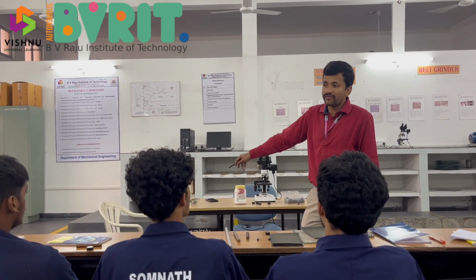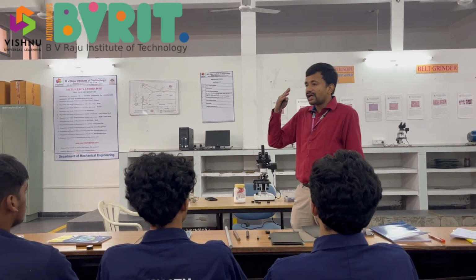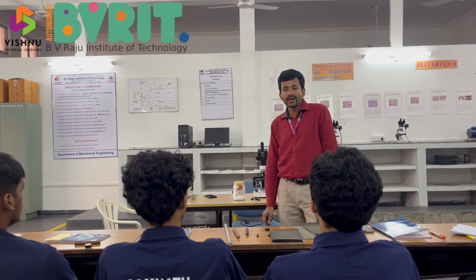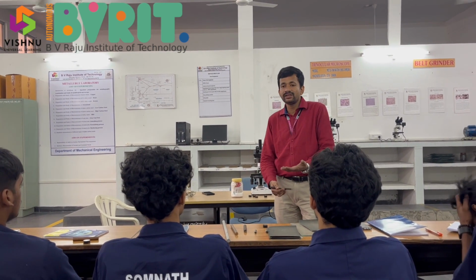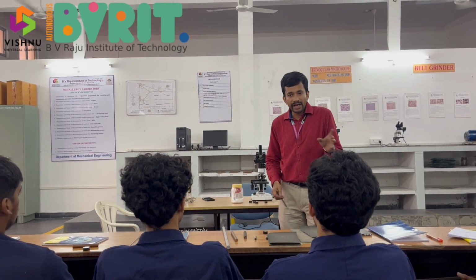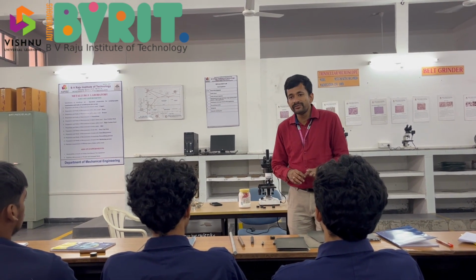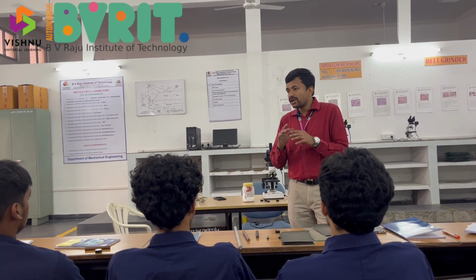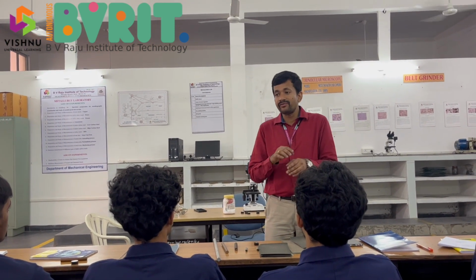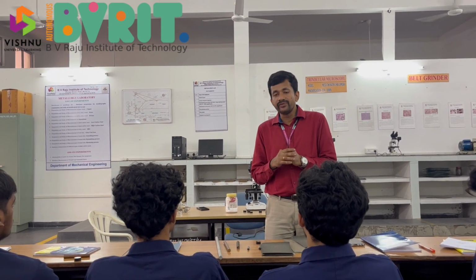Even though they are very diluted, you cannot rub your eyes after using those etchants. So whenever you have used the etchant, be very careful with your eyes and sensitive parts like fingertips, toe tips, or wherever you have any cuts. So be careful with that.